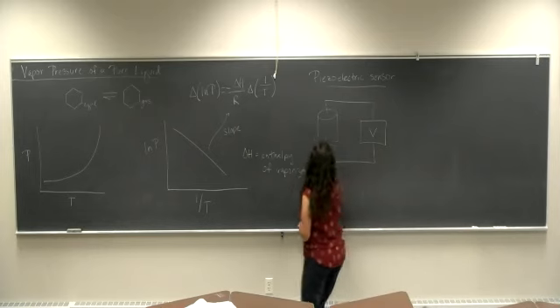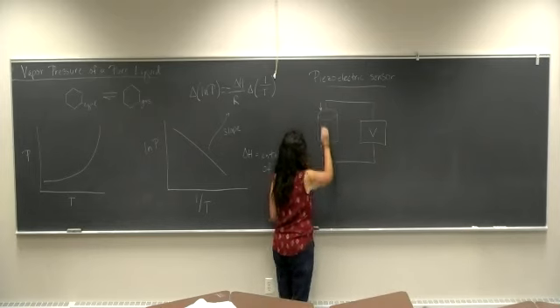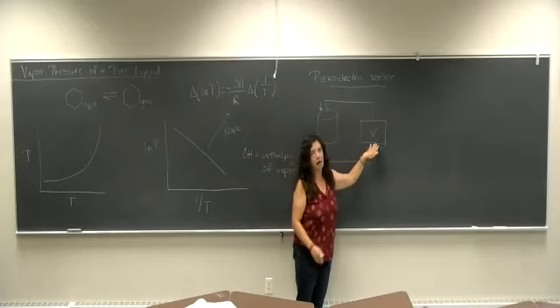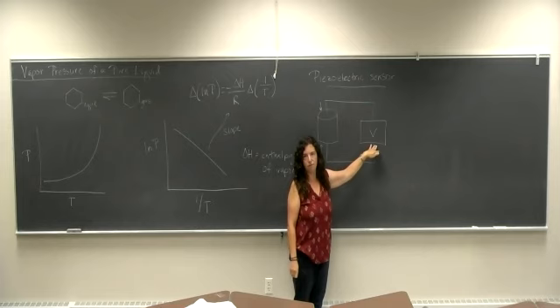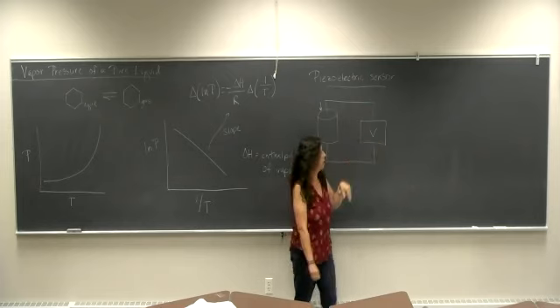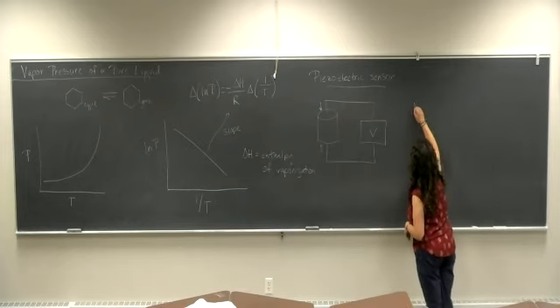So if we have some pressure on this sensor, we will see a readout as a function of voltage. So we can set our voltage at 10 volts at atmospheric pressure.